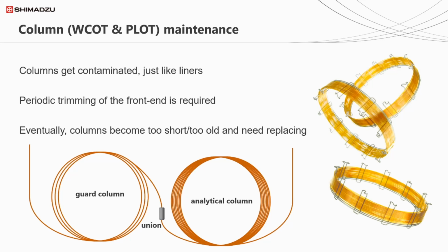To avoid this, some analysts prefer to use a guard column before the analytical column. This is exactly the same as the retention gap we used on the OCI, but usually has the same inner diameter as the analytical column. A few meters of fused silica, without any phase, means this section can be trimmed with no change in retention time.